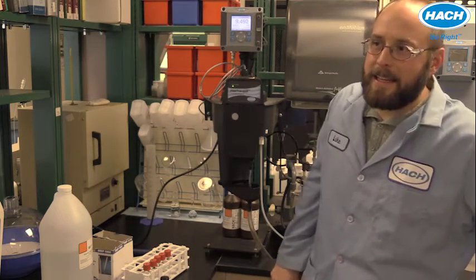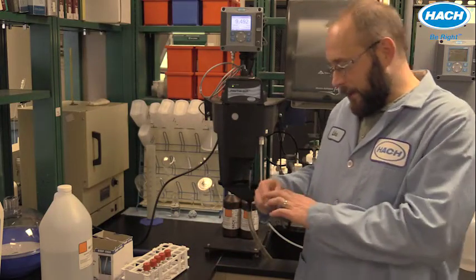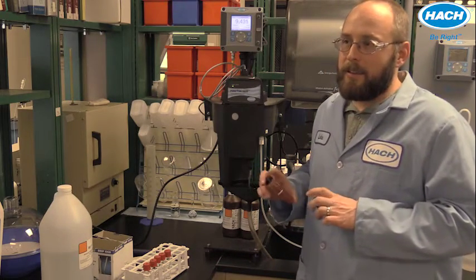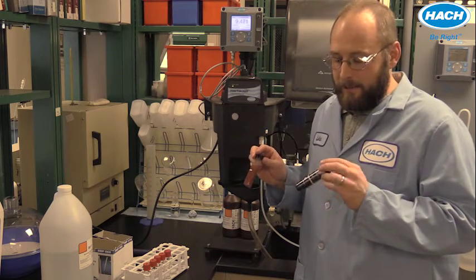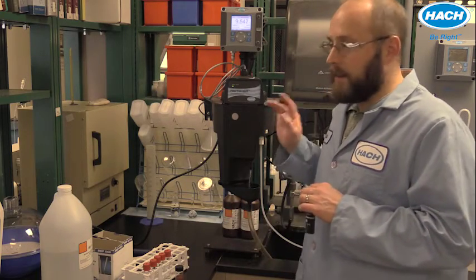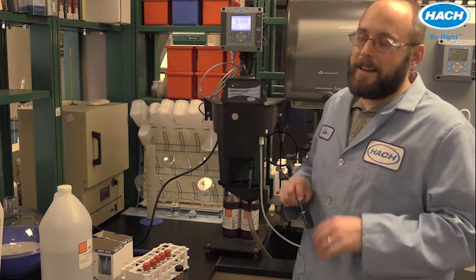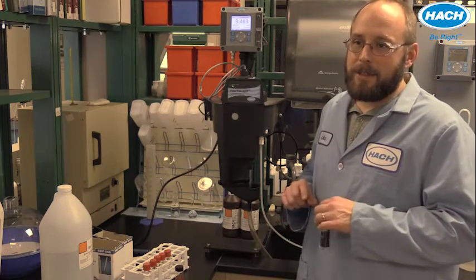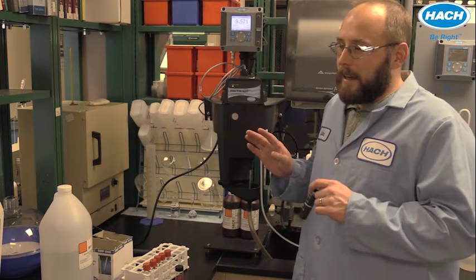Now, as I said in the application overview video, iron corrosion is generally present, greater than 90% present, as particulates. And the two main particulates are these iron oxides, hematite, which is red, and magnetite, which is black. Now, part of the limits of a turbidimeter in this application is that turbidimetry and nephelometry is not measuring iron specifically. It is measuring any particulate that will reflect light at 660 nanometers.